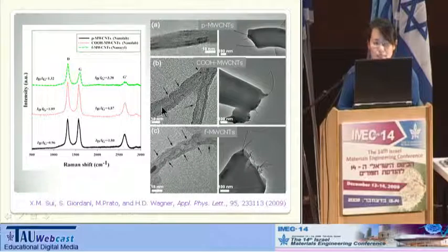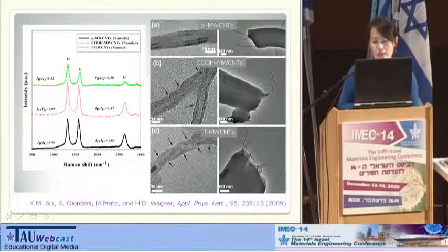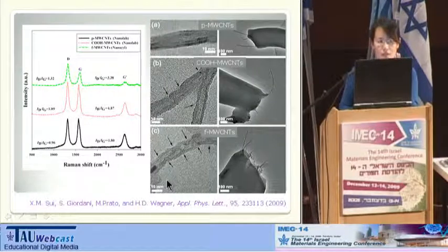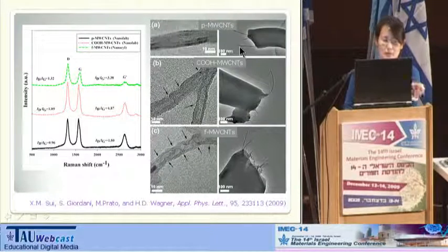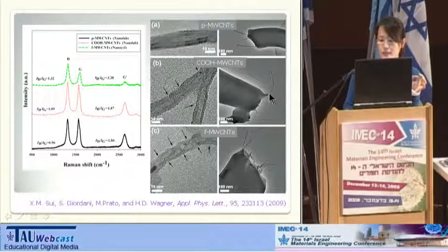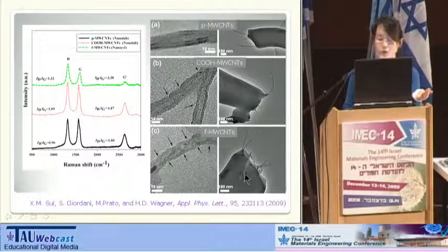After the functionalization, we see that the smooth surface of pristine nanotubes has some defects, for example, impurities like kinks, and sometimes the nanotubes just twist and collapse, which shows that there are a lot of defects in the nanotubes. And also we have some pictures of the fracture surface of the composite fibers. We see a lot of nanotubes protrude out of the fracture surface. On the surface of a pristine nanotube-based composite, we don't see any polymer attached to it, which means that the interface is very, very weak. But on the surface of functionalized nanotubes, we see that there are some polymers attached to it, which indicates a strong interface, and which means the stress transfer will be much stronger. But this doesn't automatically mean that the mechanical properties will also be strong.